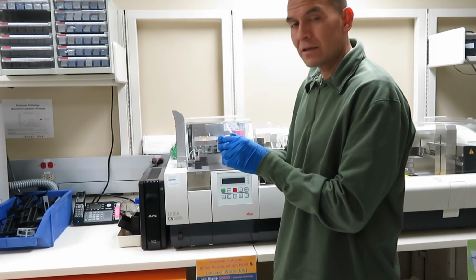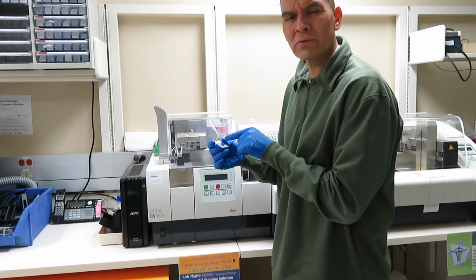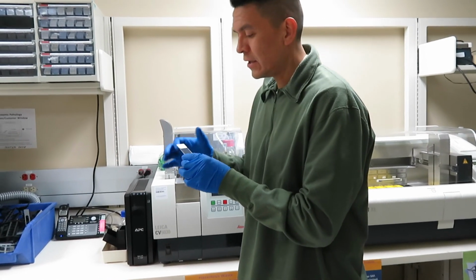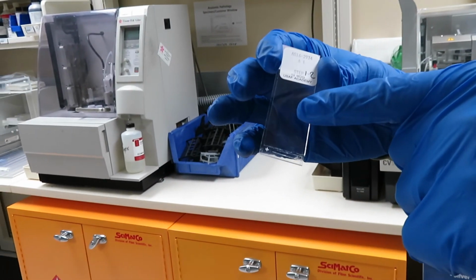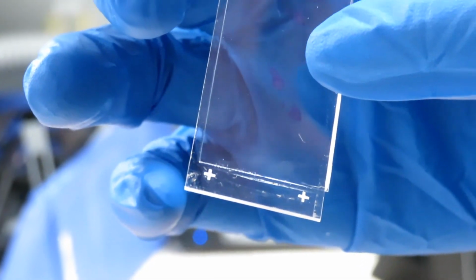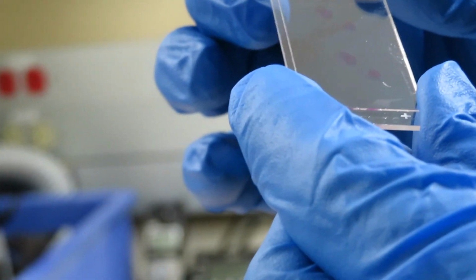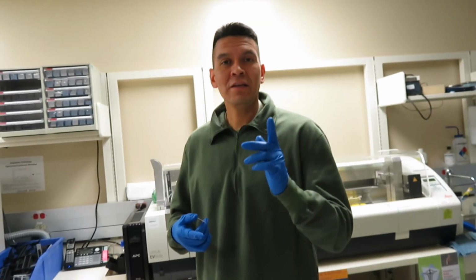It'll stick a cover slip over this with, I guess, some kind of gel glue or whatever, and it will make it stick. And so then the final product, and then our techs label it. Then our final product is the tissue that is stained up. Here it's mostly pink, which is a good thing, and then the cover slip, and it's on the slide. And that's how we create these slides. And the next clip will be what it looks like under the microscope.